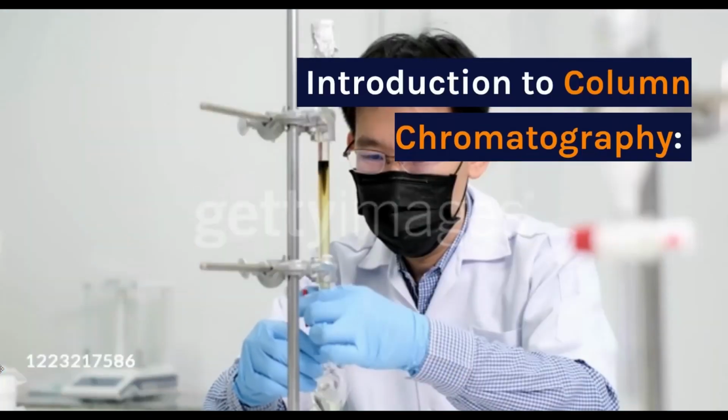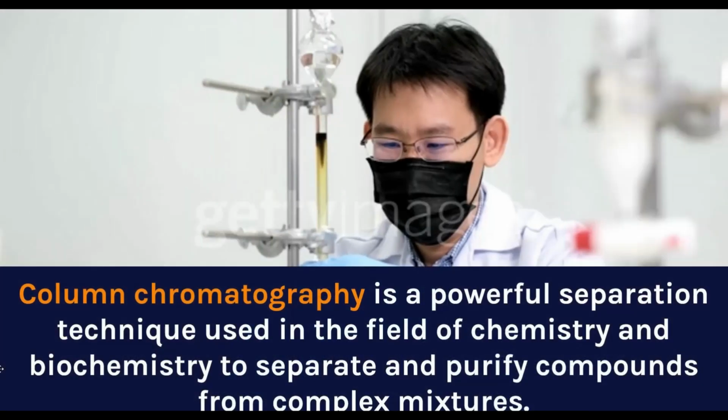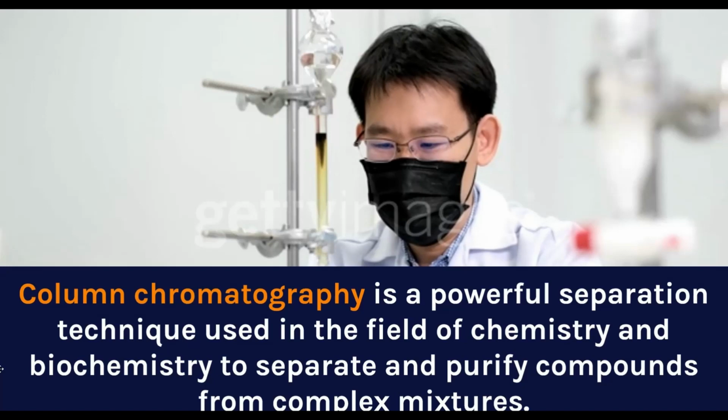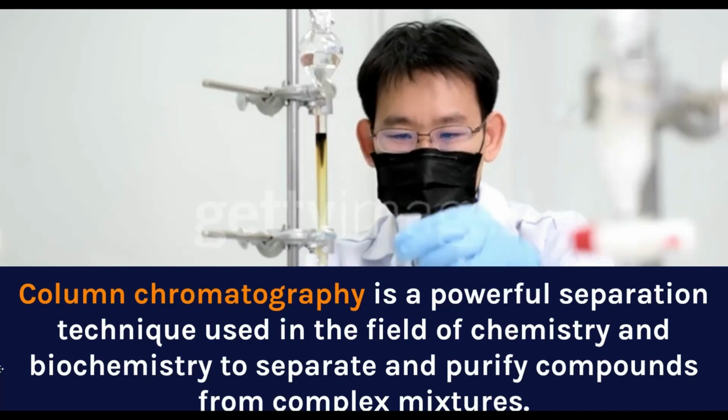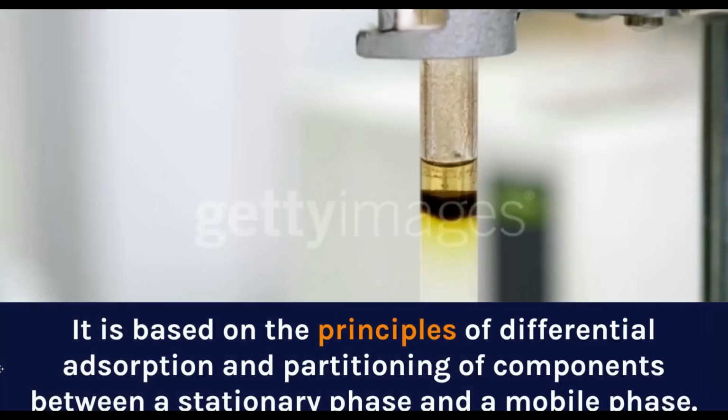Introduction to column chromatography. Column chromatography is a powerful separation technique used in the field of chemistry and biochemistry to separate and purify compounds from complex mixtures. It is based on the principles of differential adsorption and partitioning of components between a stationary phase and a mobile phase.